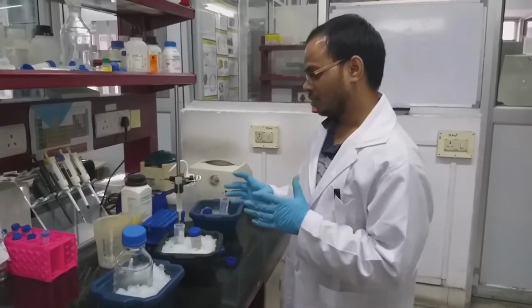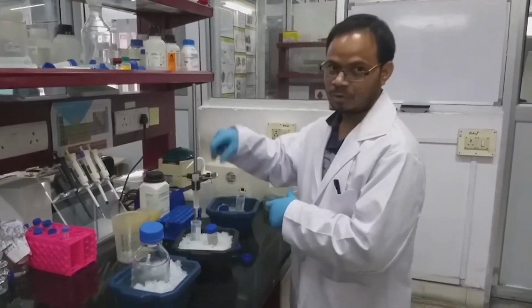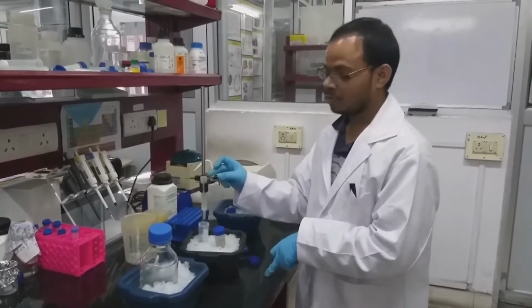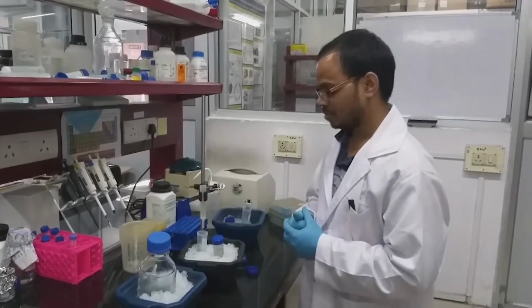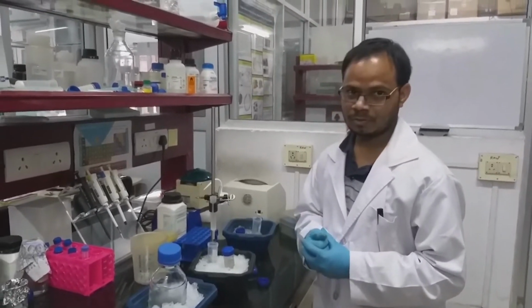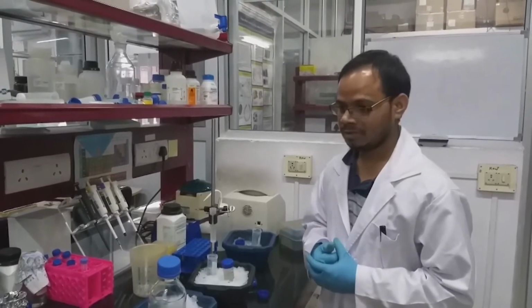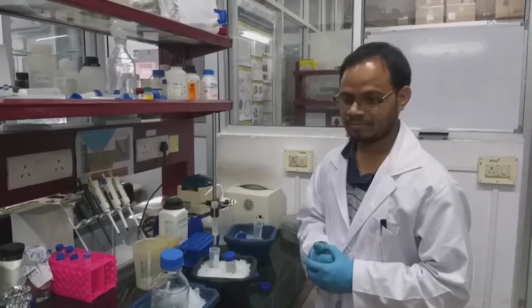Before doing this, we have to observe the beads. We should not directly load onto the beads. You just have to pour through the corner, along the wall of the column. Otherwise, it may disturb the beads, so the protein may also degrade. So we have to keep this in mind while doing this washing.